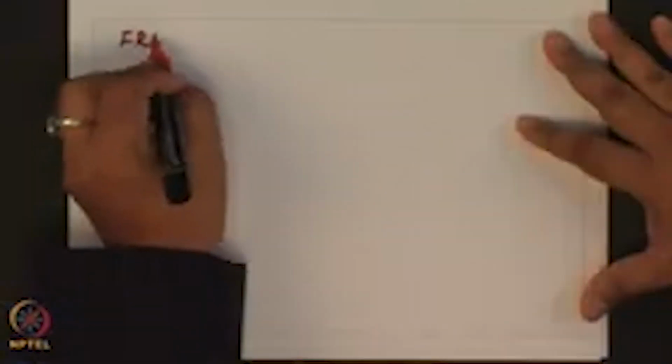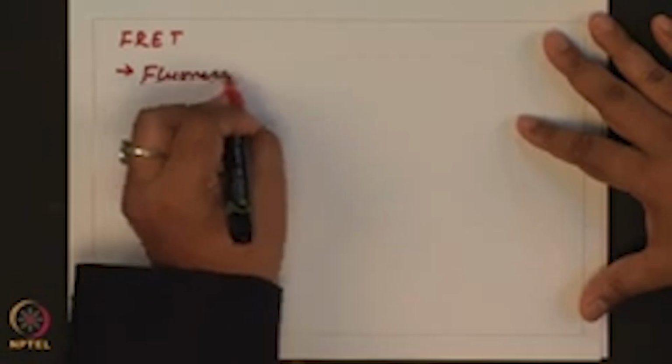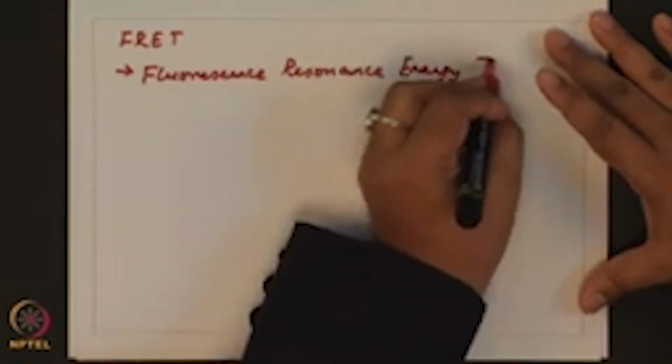FRET is short for fluorescence resonance energy transfer.